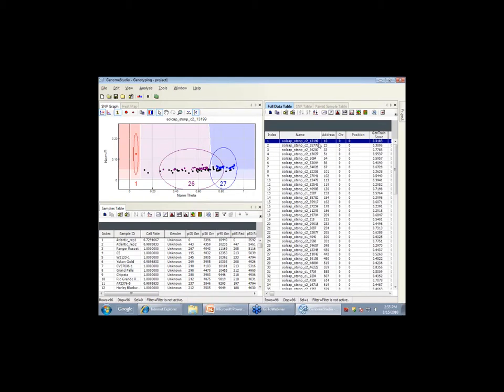I'm not positive on our nomenclature on that. I'm going to have to ask Robin. The C2 name will provide you the actual transcript sequence that it came from.